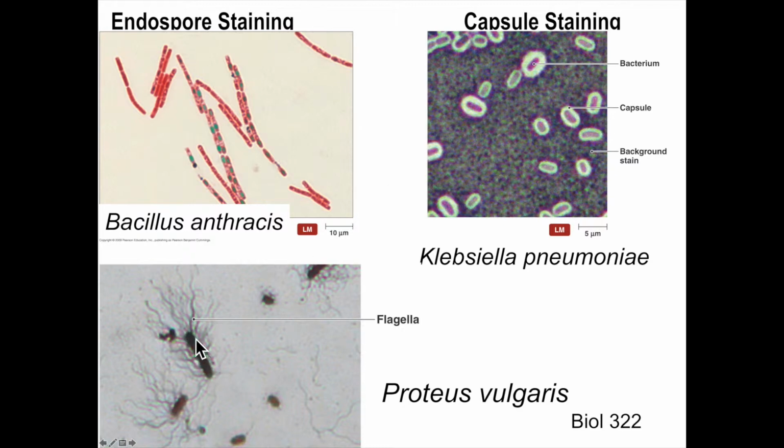And then finally here, a flagella stain. This one is really tough, but you can certainly get good results. In the microbiology class I teach here on campus, we've done all of these stains. And so this right here just shows a certain type of peritrichous flagella.